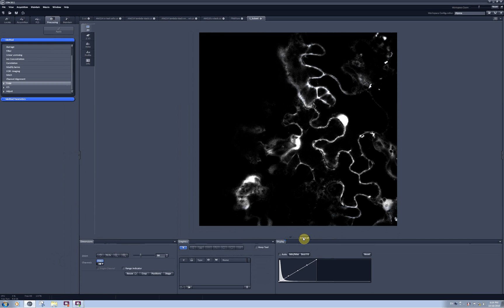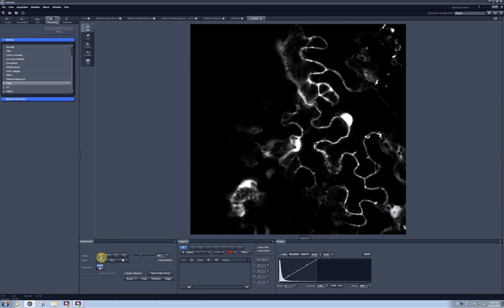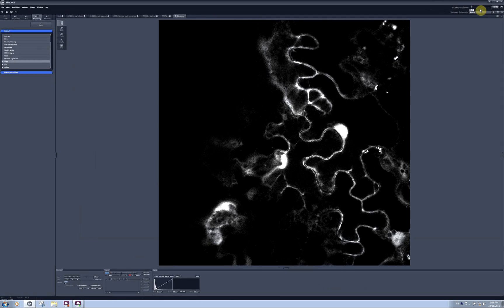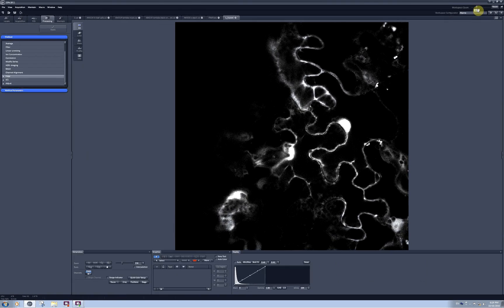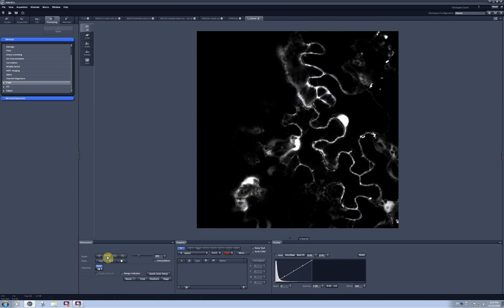You can see how many functions disappear when Show All is not selected. In the Dimensions tab you have functions to zoom in and out of your image and also to color code your channels. You can ask the software to fit the image to the size of the image window and it will automatically resize when you zoom in and out, or to show you a one-to-one zoom of your image.